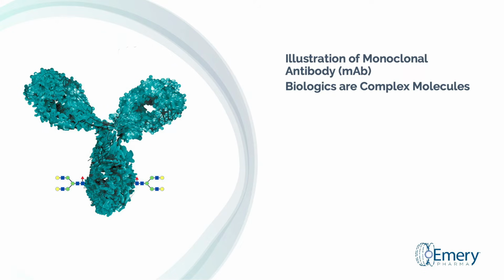The peptide mapping aspect of this work characterizes sequence coverage, post-translational modifications, disulfide scrambling, GMP release, and sequence variants. Biologics, such as monoclonal antibodies, have molecular weights of more than 148,000 and require several different analytical methods to characterize the chemical properties. By comparison, small molecule pharmaceuticals have molecular masses close to 500 and typically have one definitive HPLC method. This is not the case for biologic molecules.